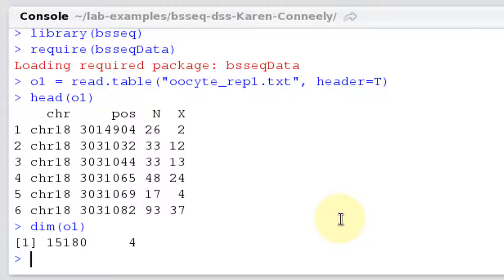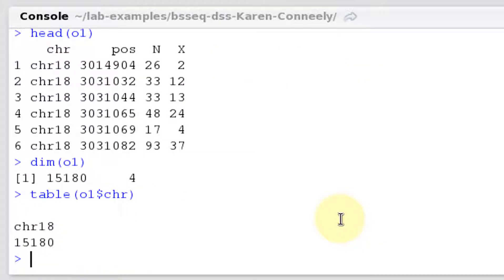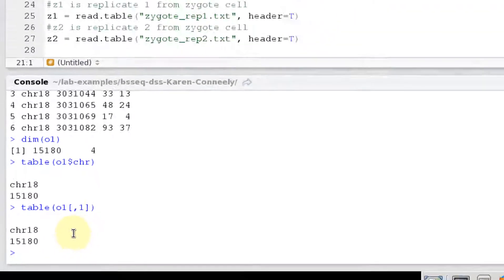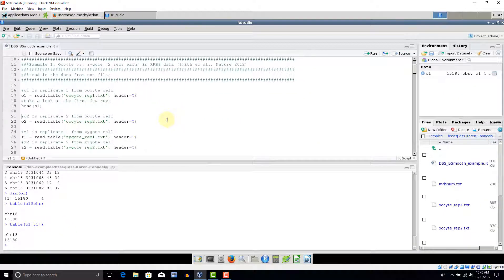We might notice the first column is chromosomes, so let's do a table of that to see if we have all the chromosomes or just some of them. I'm doing o1$chromosome, which refers to the column named chromosome. Another way to do this in R would be to just ask for the first column by subsetting the matrix. Both approaches give us the same answer: all 15,180 rows are from chromosome 18. That's why this dataset is so small — it's just chromosome 18 and it's reduced representation data, which is a manageable dataset to play around with.